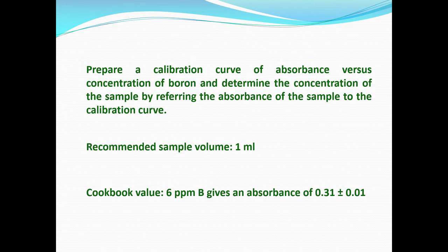Therefore, we have not spent enough time to discuss the interferences for this method. Okay. And then we had discussed the recommended sample volume. This sample volume is what you analyze. First, this is apart from the standard. So, along with the standard you have to run the sample and then get the typical quantity.